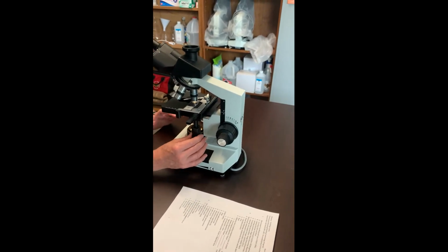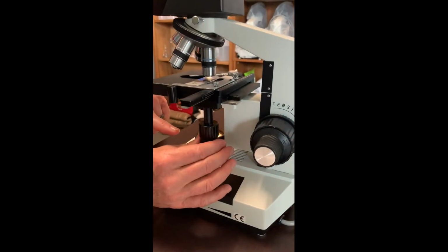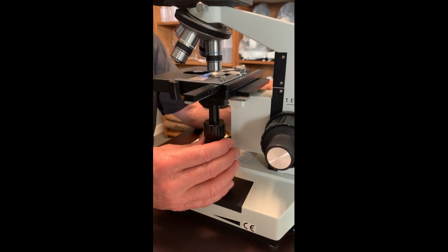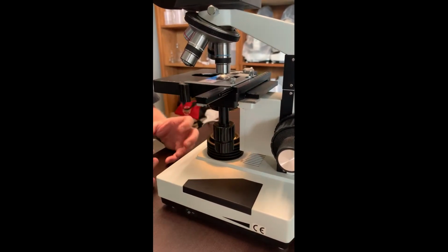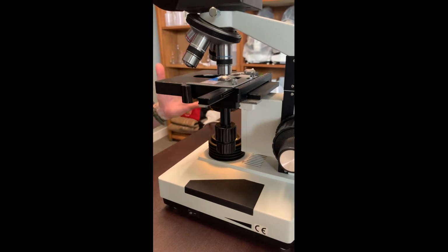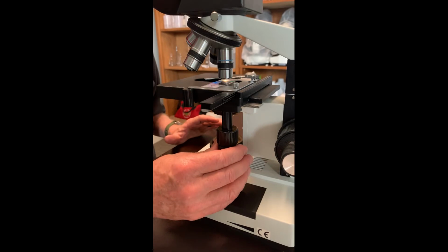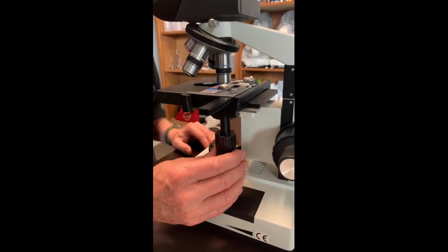You can wiggle the slide. I'm just moving the slide a little bit either way. It doesn't look like much here, but looking under here, it is moving quite a bit. I'm going to wiggle this, and if what I've got in focus moves, that's the object. If I wiggle this and what I'm looking at doesn't move, that means you don't have the object in focus. I hope that makes sense.